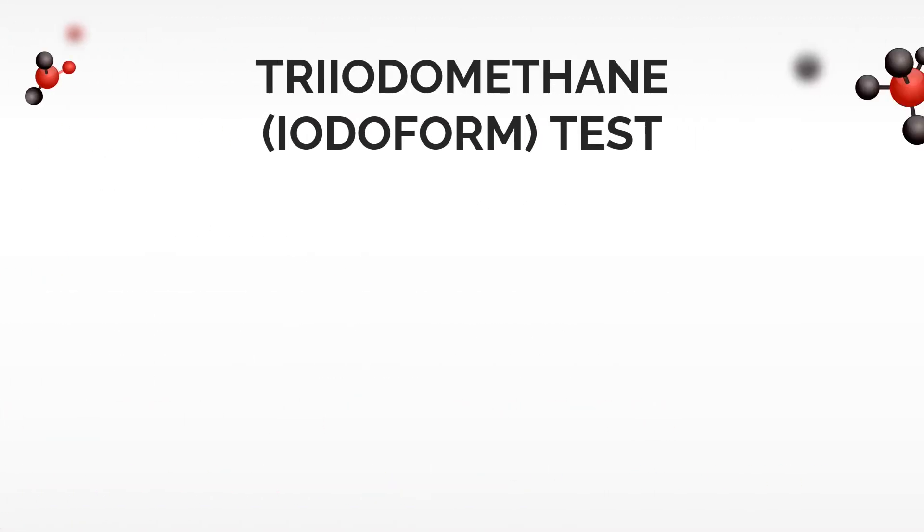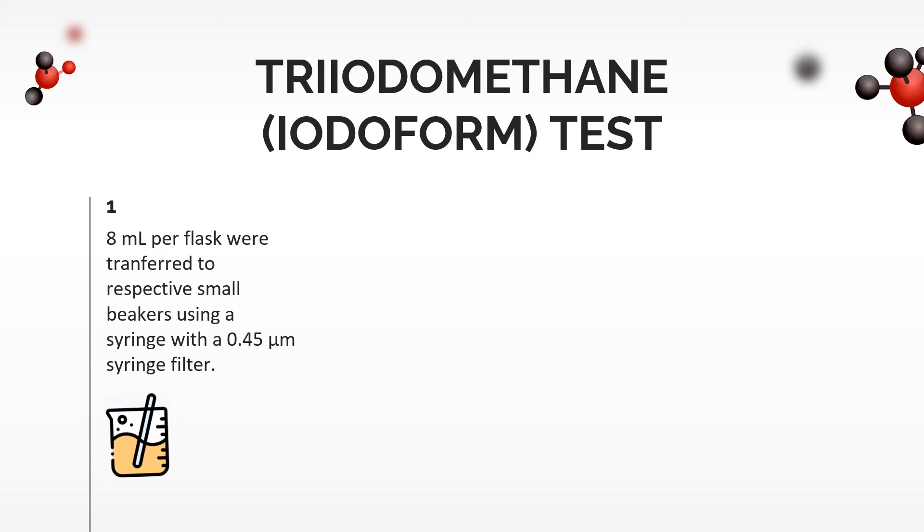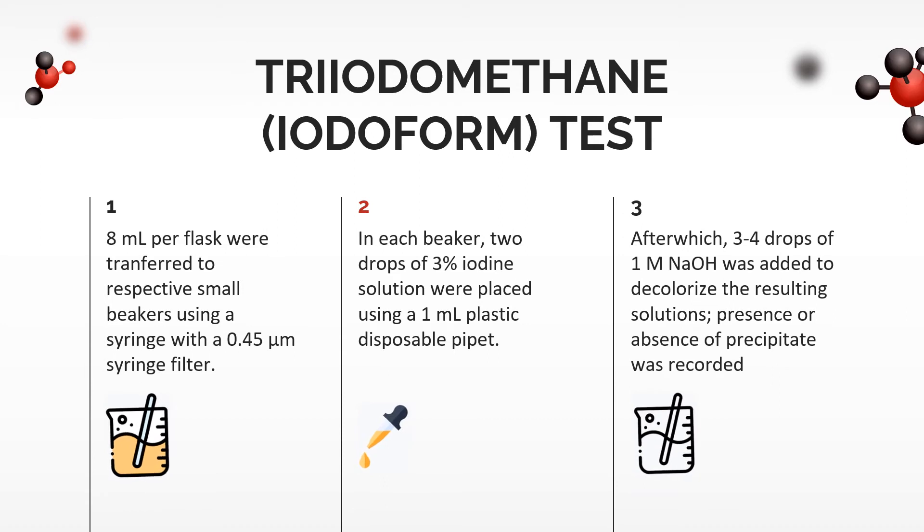After the gas measurements have been completed, we can test for the presence of ethanol using the tri-iodomethane test. Using a 10 ml syringe, 8 ml of material from the cultures were transferred and expelled through a 0.45 micrometer syringe filter into respective beakers. Using a 1 ml plastic disposable pipette, 2 drops of 3% iodine solution were introduced into each beaker to oxidize any ethanol present. Lastly, 3-4 drops of 1 molar sodium hydroxide was added to decolorize the resulting solutions, and the presence or absence of precipitate was recorded.